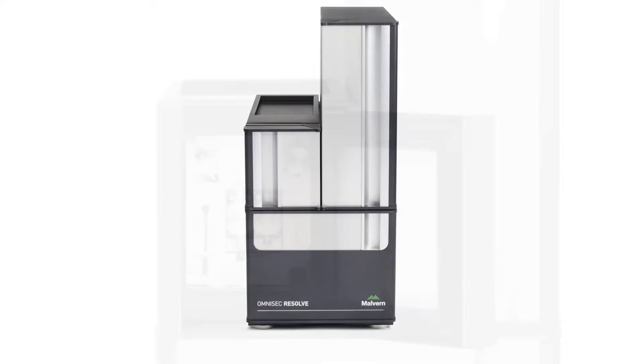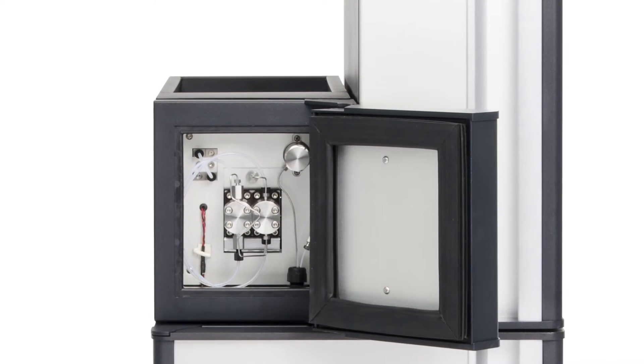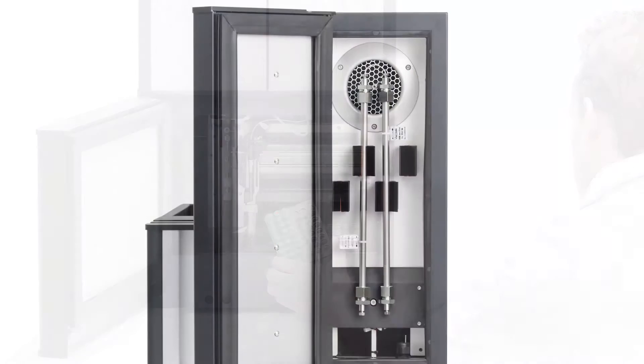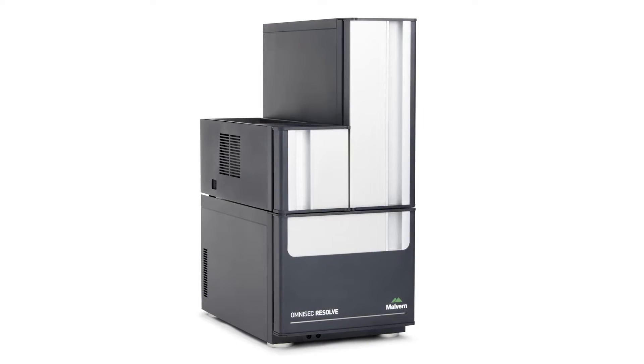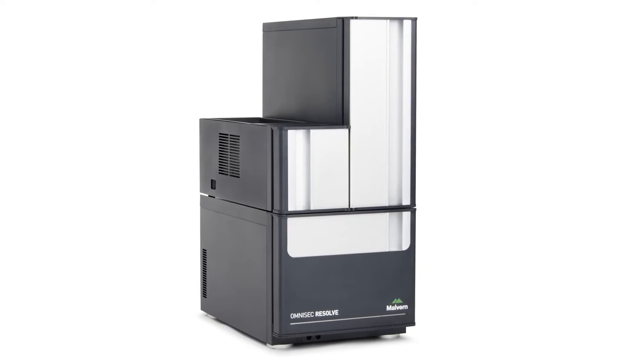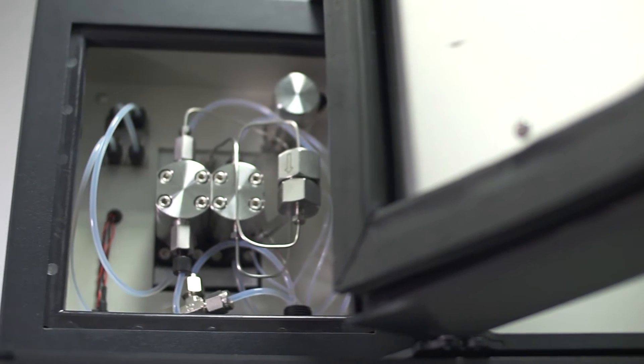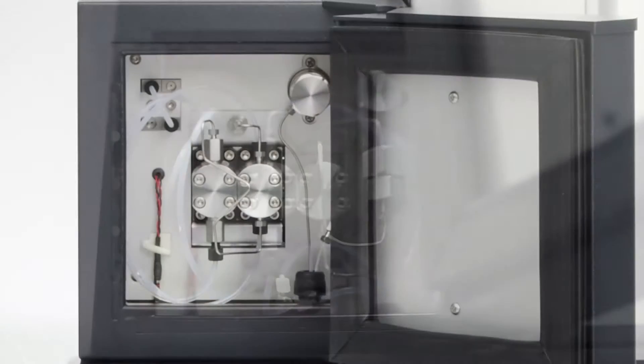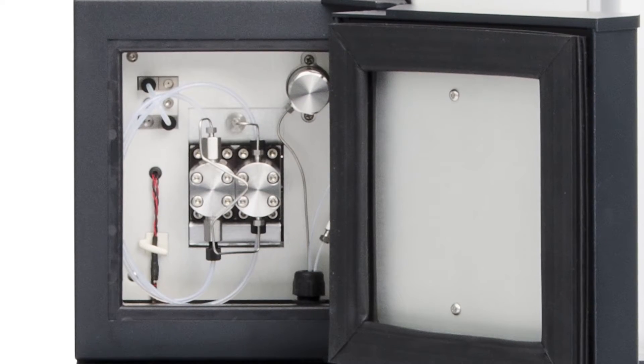Omnisec Resolve is an integrated pump, degasser, autosampler, and column oven for managing the separation in a single advanced separations unit. The self-priming isocratic pump has been designed with excellent flow rate and baseline stability.